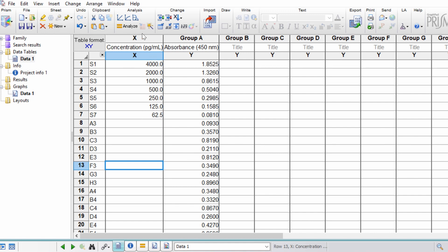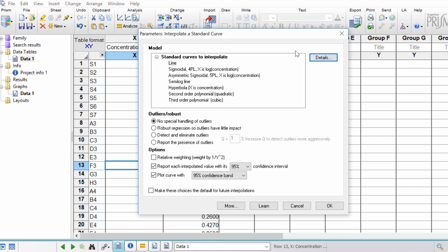Now to interpolate a standard curve in GraphPad, what you want to do when you have the datasheet open is under the analysis ribbon, you see this interpolate a standard curve option and you want to click this. So a new window will now open. The first thing you need to do is to tell GraphPad what type of standard curve you have.